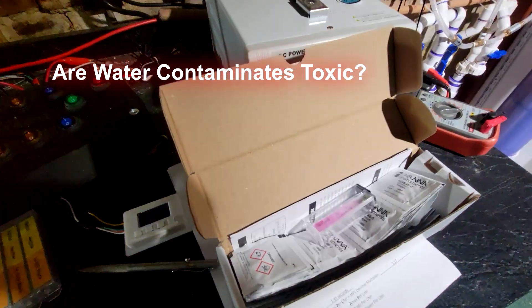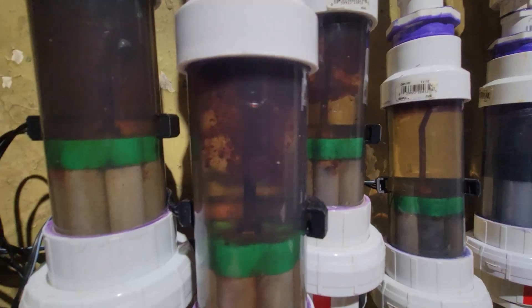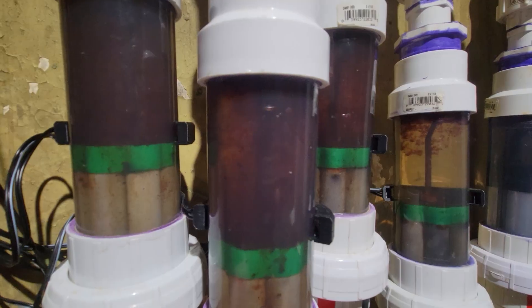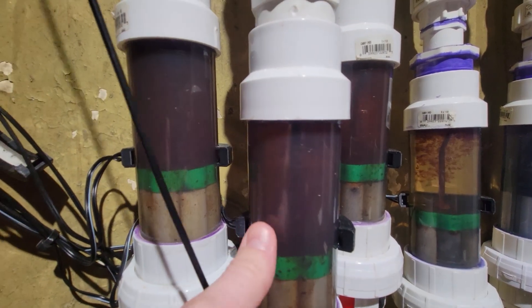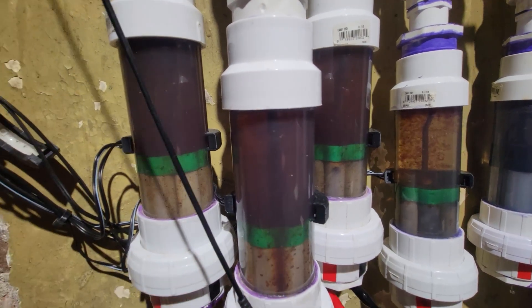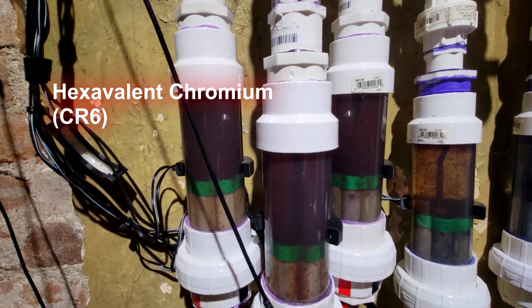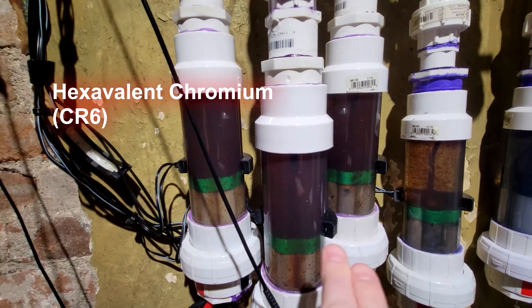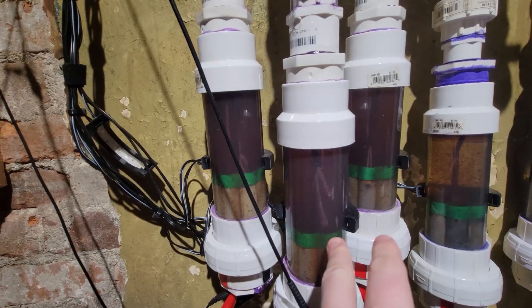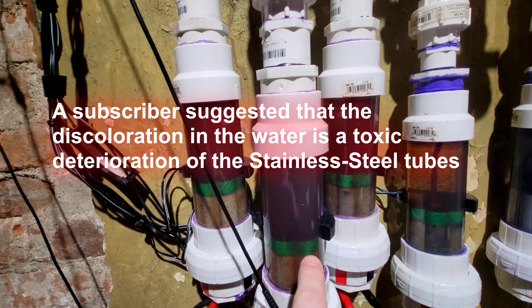All right, today we are settling a debate. You can see the contaminants in this water here, mostly floating to the top, but you can see it when the cell is active and when you mix it up. Some claim this to be hexavalent chromium, which is a harmful compound, specifically from the deterioration of the stainless steel plates or tubes — in my case, 304 stainless steel.